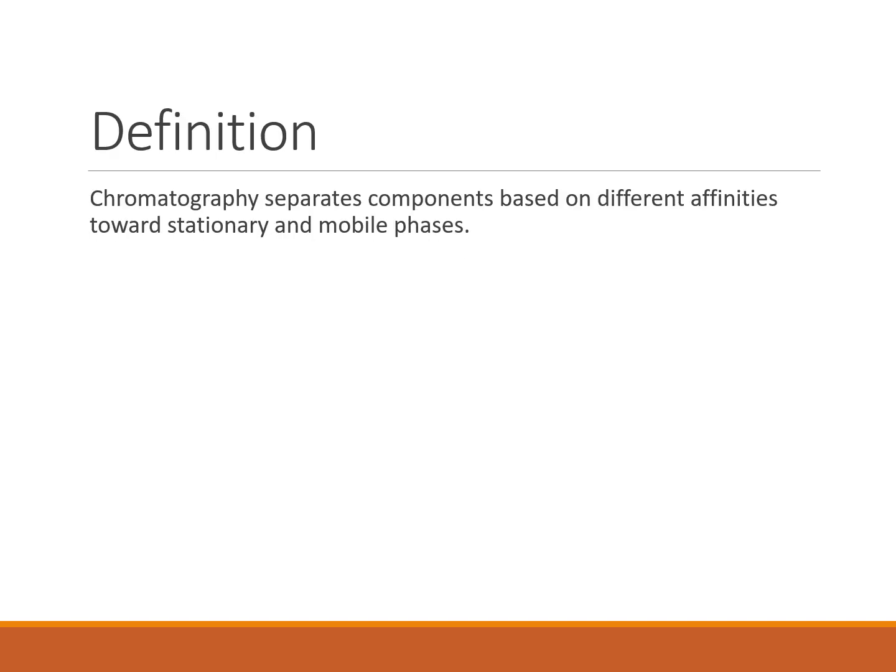Now, chromatography can be defined as a technique in which the components of a mixture are separated because they have different affinities towards two phases, a stationary phase and a mobile phase.